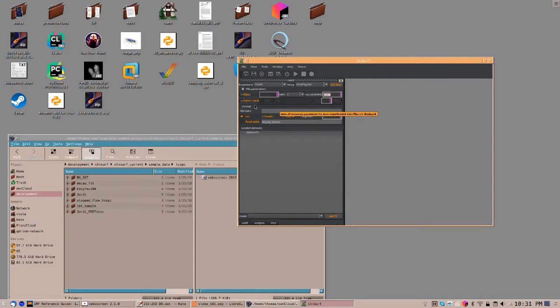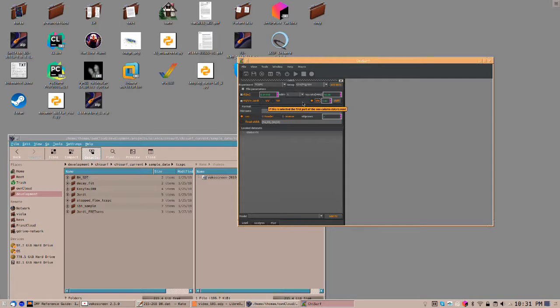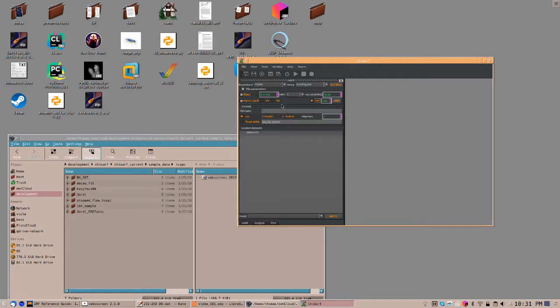In case you have a Jordi file, click here on Jordi file and select the channel you want to analyze. Here, VM refers to a magic angle fit, where parallel and perpendicular are summed up for a given g-factor.